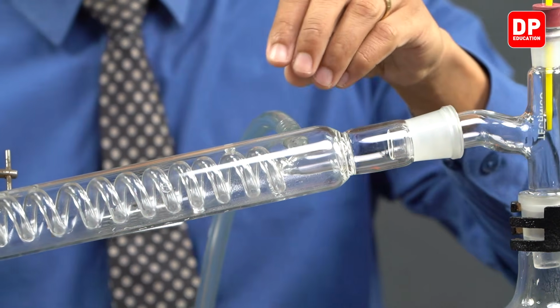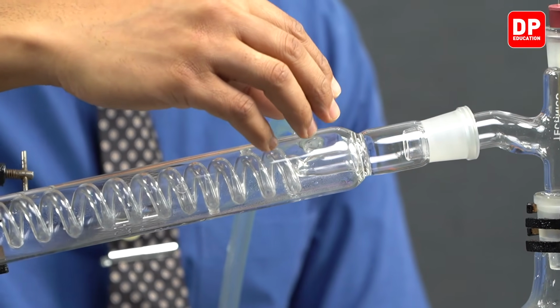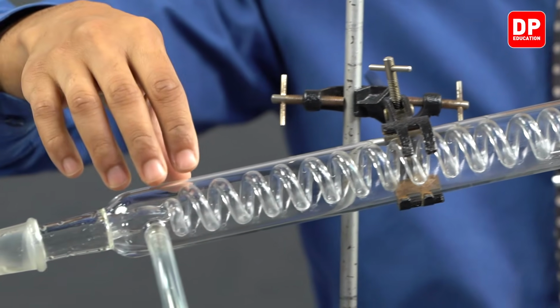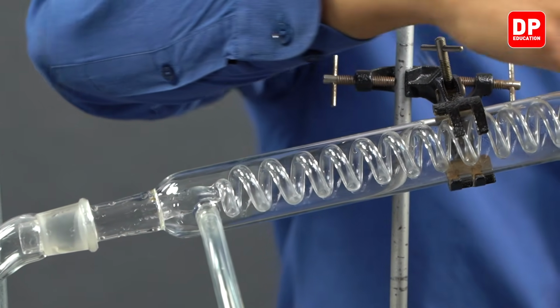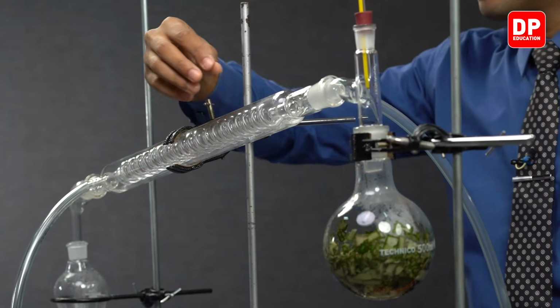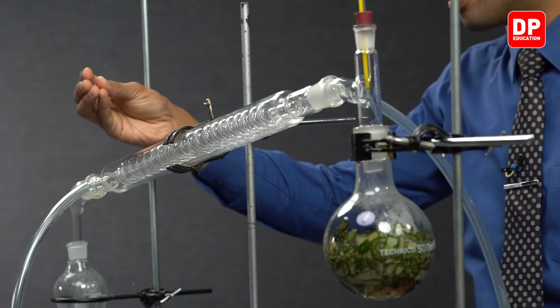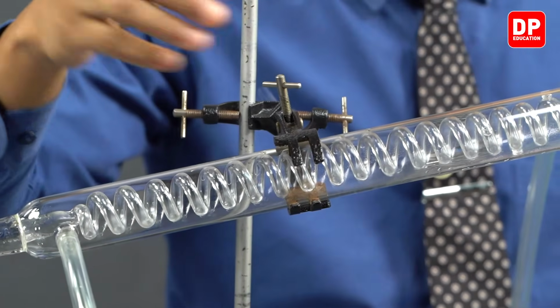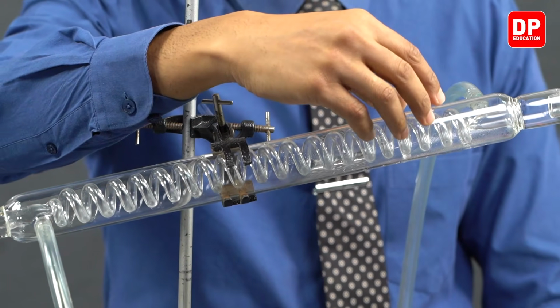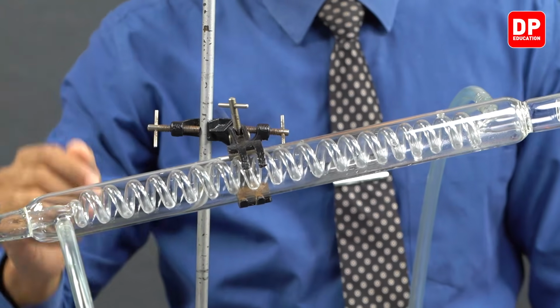And as the gaseous mixture moves from this top end of the condenser all the way to the bottom of the condenser, due to the water jacket that is present around this spiraling glass tube inside this condenser, you will see that this particular gas mixture will cool down. It will cool down below their boiling points. So therefore, this gaseous mixture will turn into a liquid.